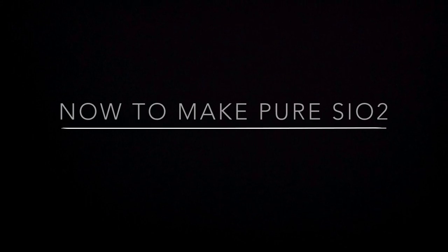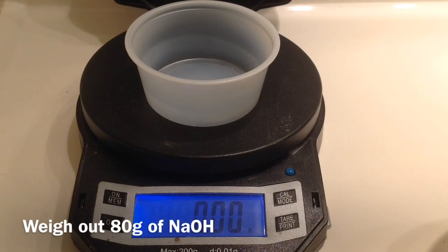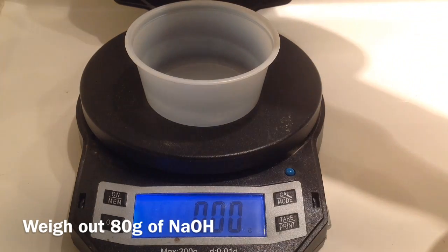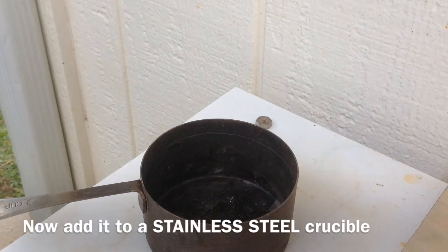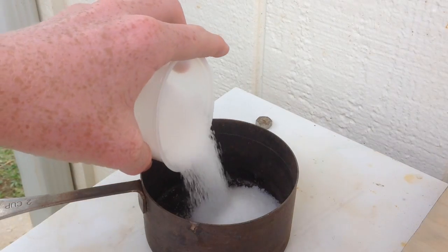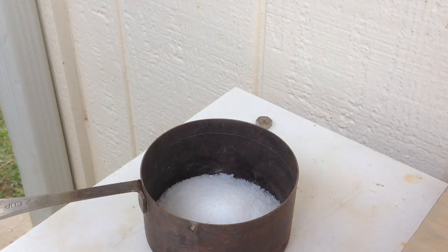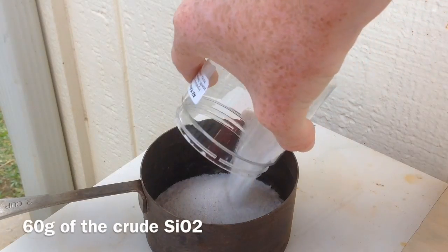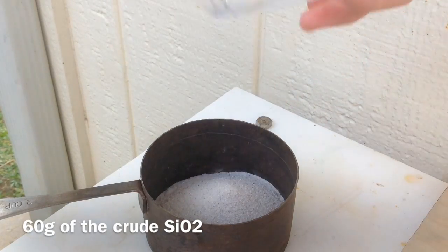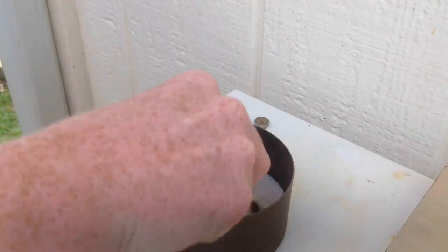To purify the sand into pure silicon dioxide, we start by weighing out 80 grams of sodium hydroxide. We transfer it to a stainless steel crucible, because it will eat through almost any other kind of crucible — you could possibly use a copper pot. Then we add 60 grams of our crude silicon dioxide and mix it in with the sodium hydroxide.